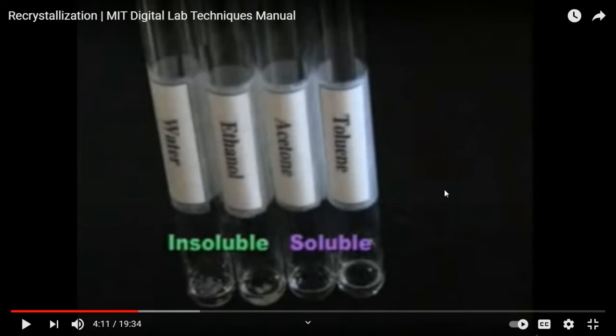Then among the solvents that don't dissolve your impure solid sample at room temperature, you are going to heat up. That's the second stage. After heating, while they're boiling, whichever boiling solvent is able to dissolve it, from the chosen ones from the first stage at room temperature testing.